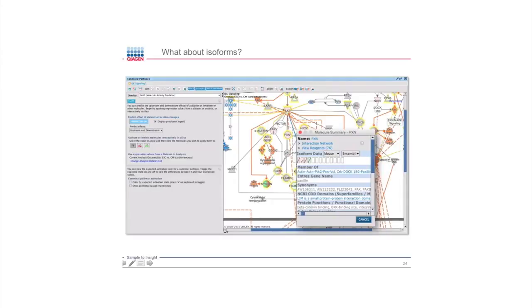Some of them, the white ones, don't have any expression in the data set, but the ones that are colored do have expression. There's 4 of them. And the way these are ordered, left to right, is from largest to smallest transcript. Essentially, first we look at the largest protein coding, and then for the ones that don't code for protein, we look at the largest at the nucleotide level. So the protein coding ones will be at the far left, the largest ones.